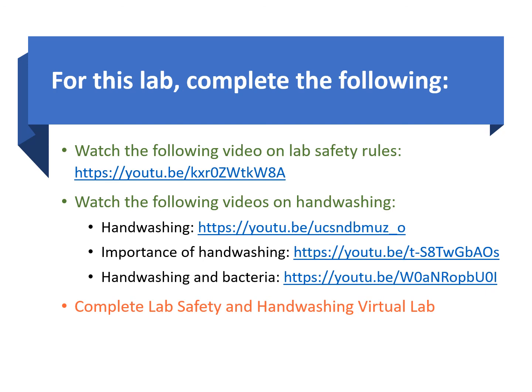There are the following websites that I recommend that you check out and watch those videos. You're going to watch a video about hand washing and the importance of hand washing. There's also a video about lab safety rules, so go ahead and check them out. For this lab, you're going to complete the lab safety and hand washing virtual lab.